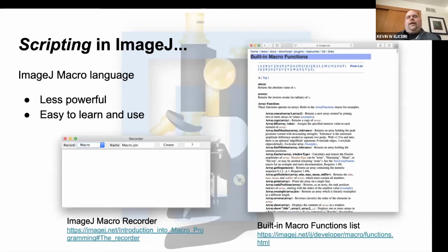And one of my favorite things is a pipeline tool. If you're on this call and you have no programming ability, I think one of the great unheralded tools is this ImageJ macro recorder. There have been many scientists who've never programmed before that have written really tremendously powerful macros and scripts by using this idea of a little tape recorder, you can see the link there, where you have this running. Whenever you do something manually, it automatically creates a script. And so this is a way for a bench biologist with no programming background to be able to do automated analysis without actually asking someone else to write it for them.